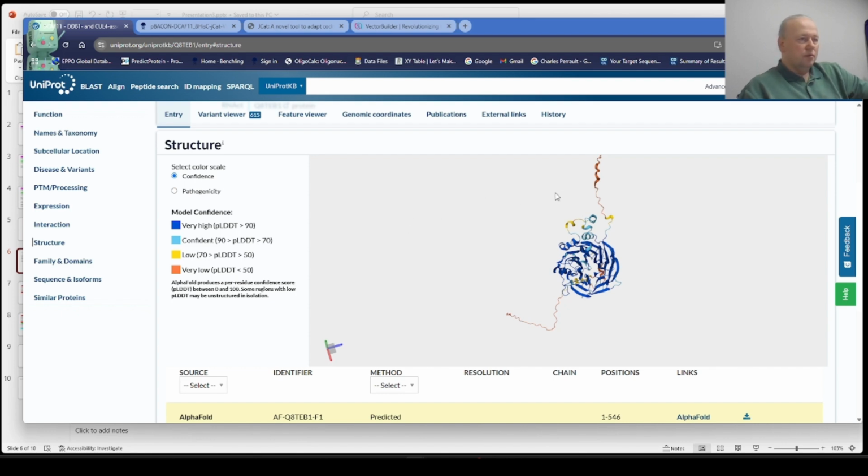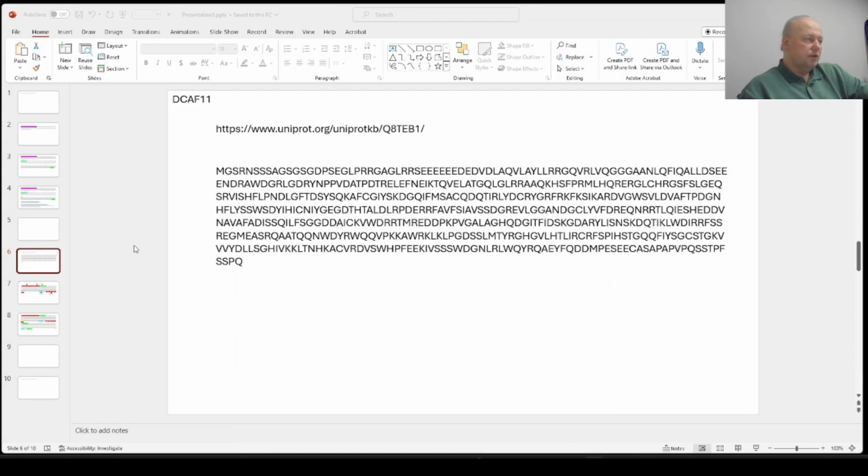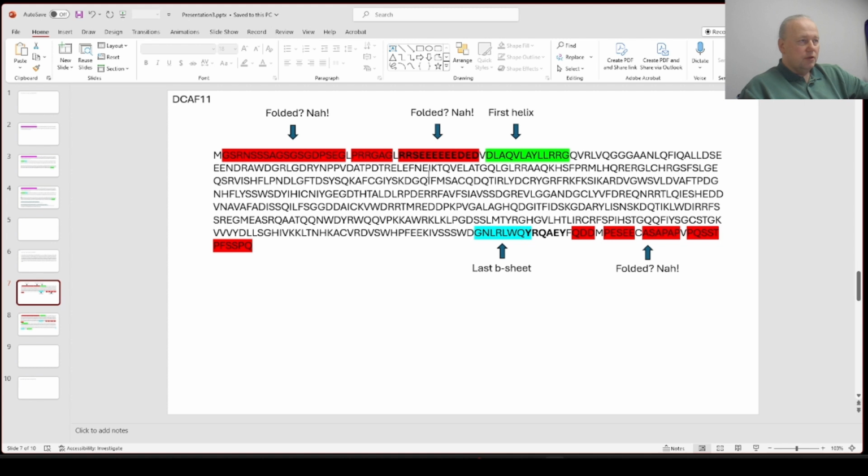So our goal is to determine what this protein structure actually is, for which purpose these long disordered tail ends are probably not very conducive. Obviously, we're dealing with the model here, and again, obviously for folks who are interested in a purist application of prior knowledge, we're not going to really use this for our work. Instead, we're going to do secondary structure prediction, which I've done behind the scenes, secondary structure and multiple sequence alignment, which indicate that indeed these sequences marked in red probably don't have a lot of fold to them.